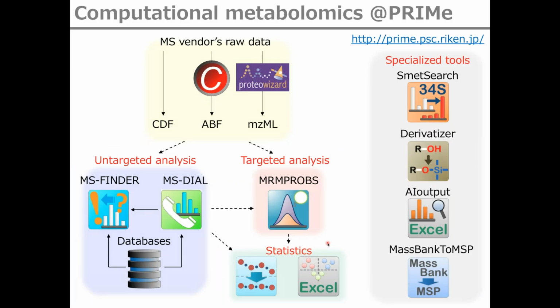Therefore, so far, I developed several software programs which are currently available at the Riken Prime website. Of these, probably MS-DIAL and MRMPROBS are the most universal programs, which support all of the metabolomics workflow from raw data import to statistical analysis.